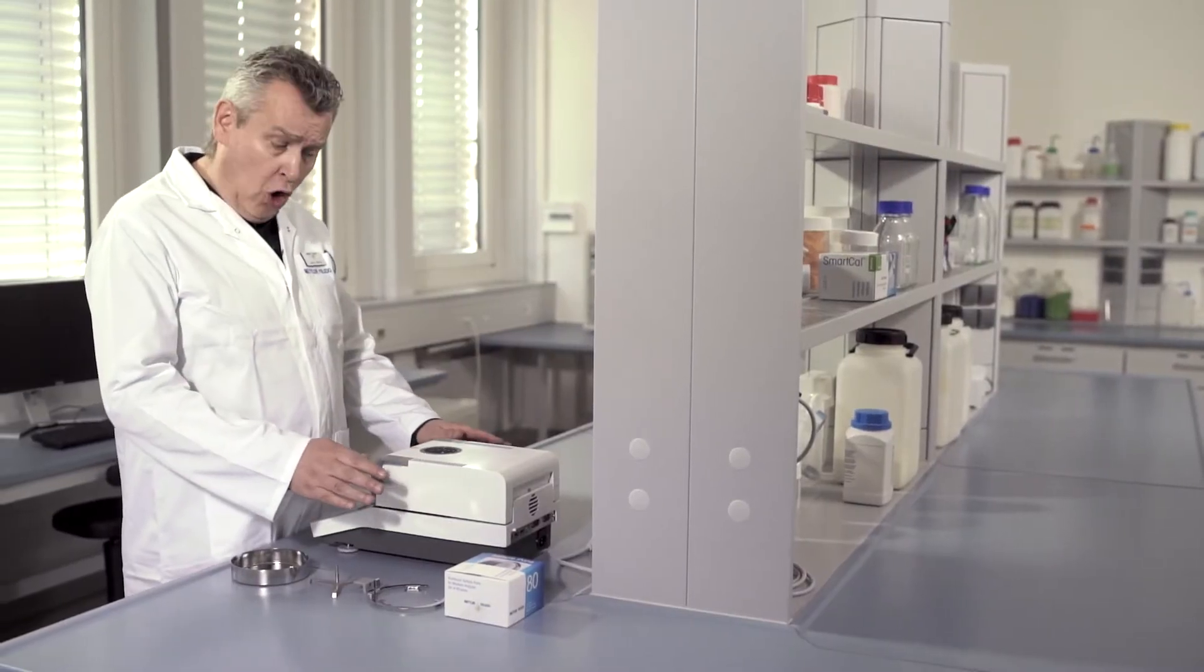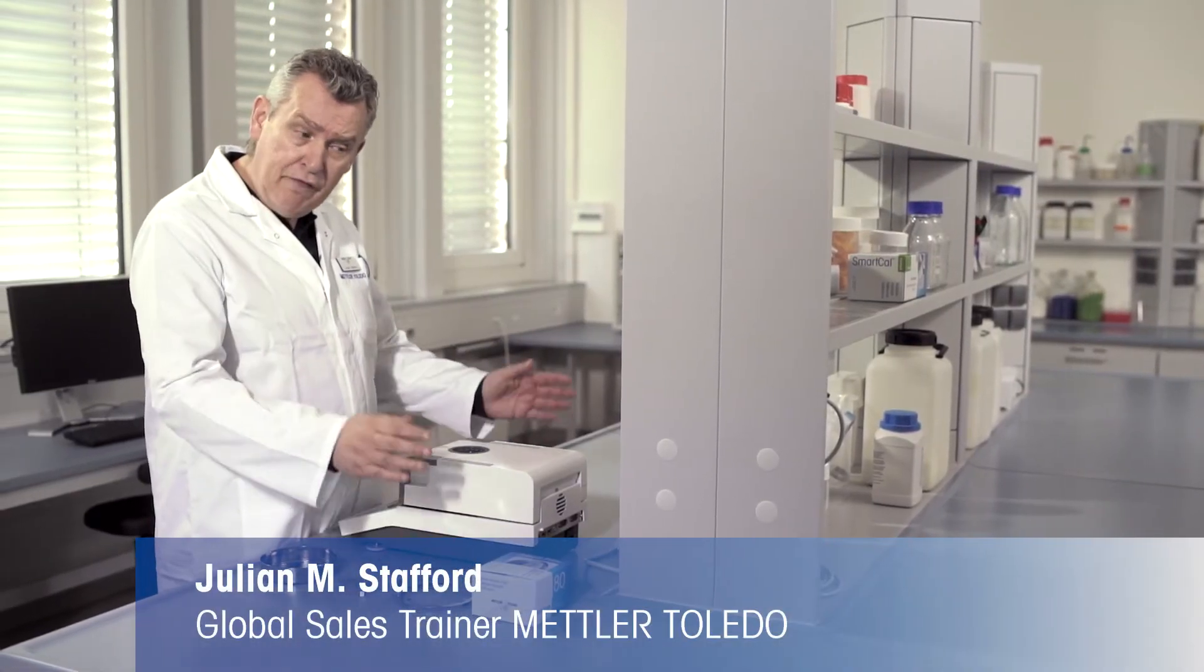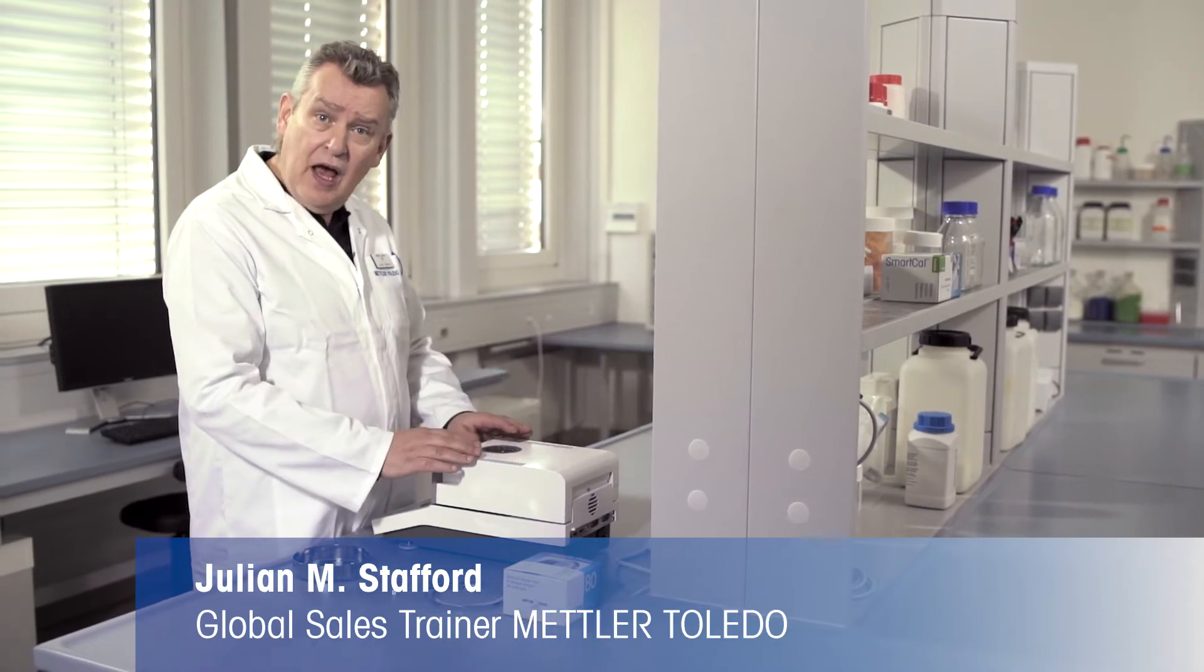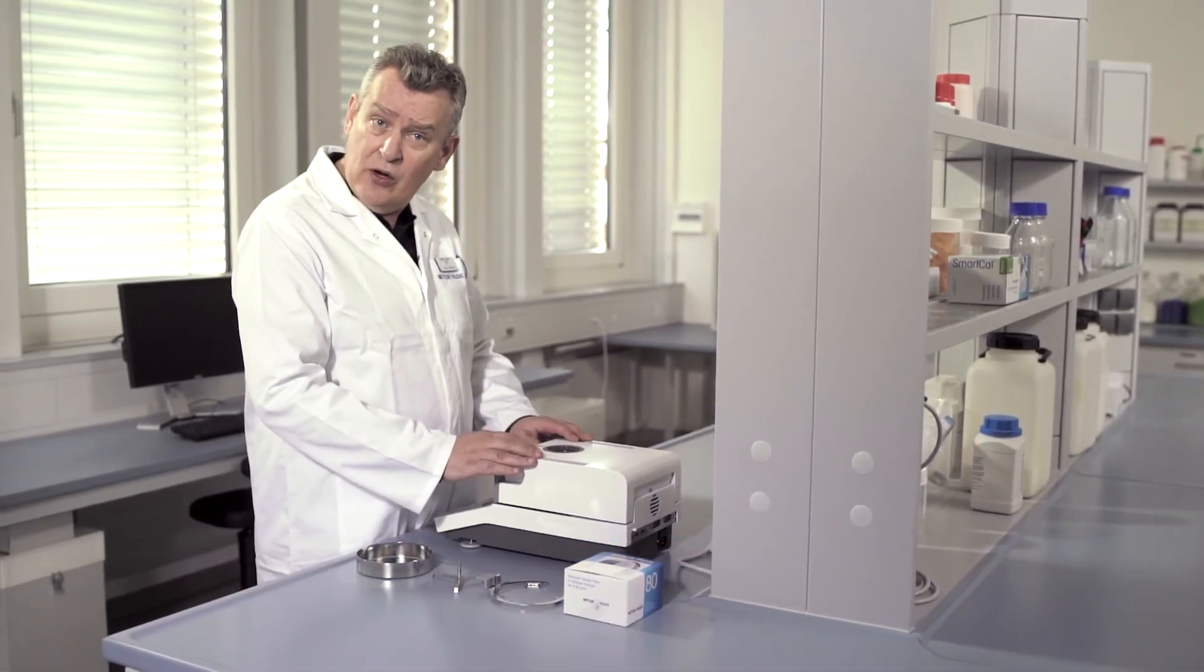Place the instrument on a stable table avoiding air drafts and then put the instrument together in the following order.